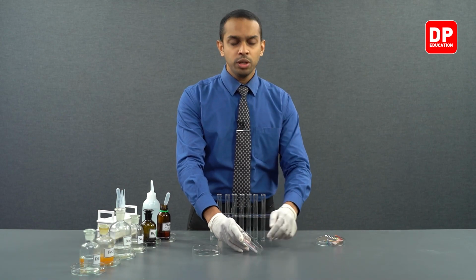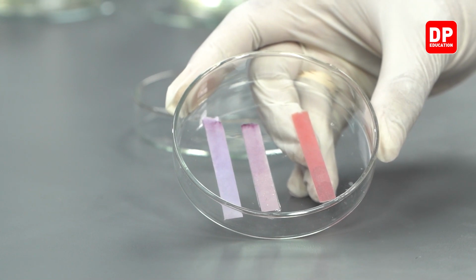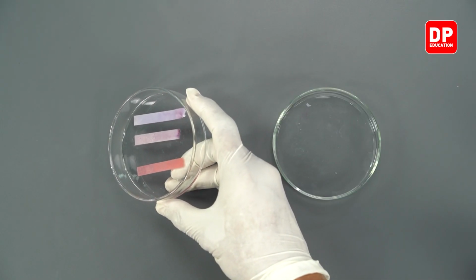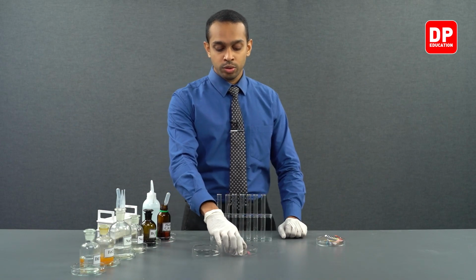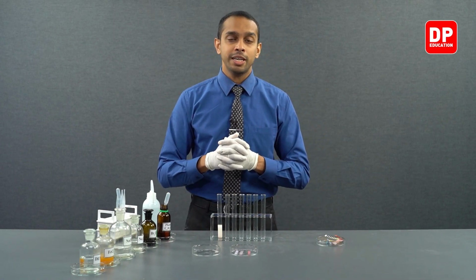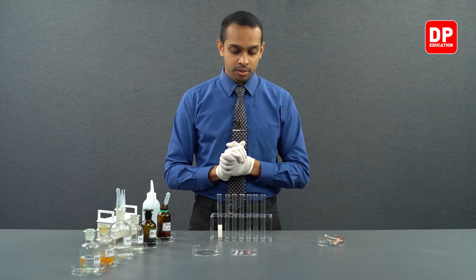Now, you would not see a very dark red color in the blue litmus paper, as phenol is not a strong acid. It is not going to be indicating strong acidic properties. So that is why the color change you see in the blue litmus paper is not very prominent.